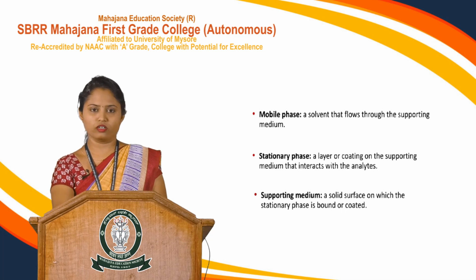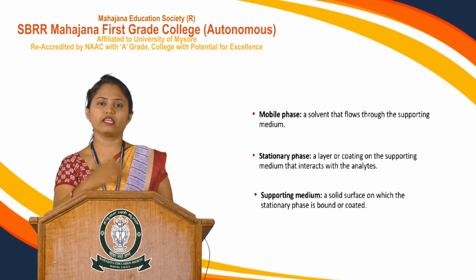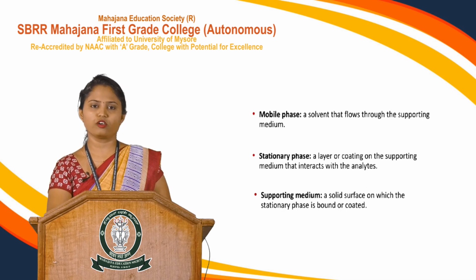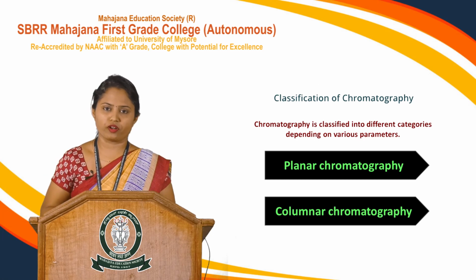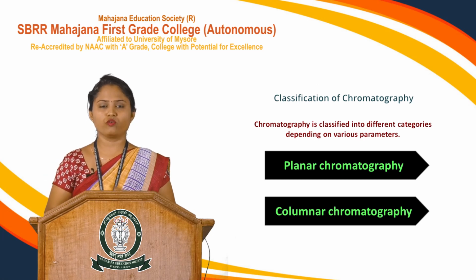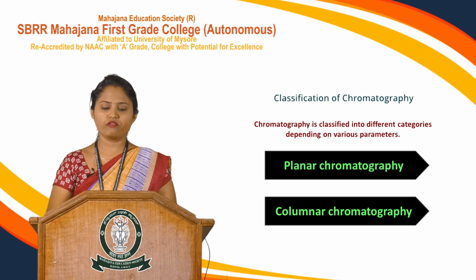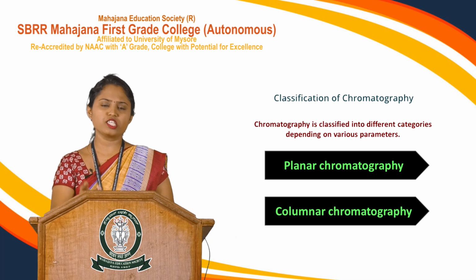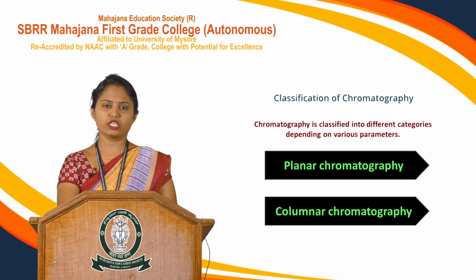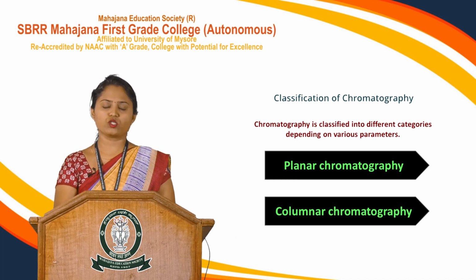So, once we are clear with what is mobile phase and stationary phase, to understand the next principle of affinity chromatography, let us understand the classification of chromatography. A brief overview on the classification of chromatography. This chromatography technique can be classified and divided based on various parameters. It can be based on geometry, it can be based on mode of operation, it can be based on nature of stationary phase and mobile phase and all.